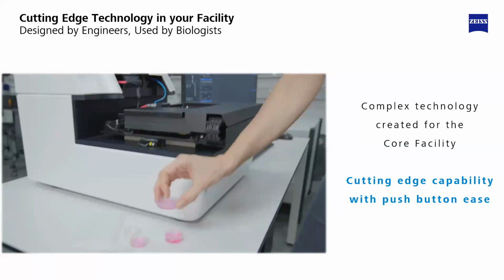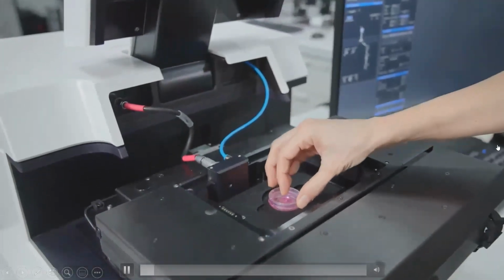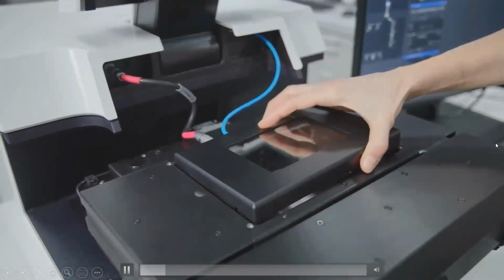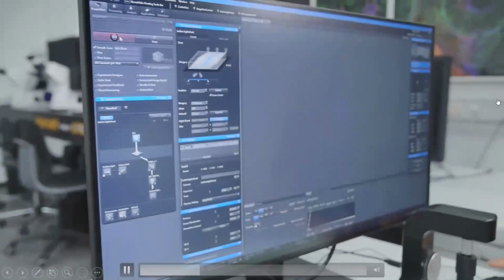Having a microscope with high technical capability, but that requires a dedicated technician to run it, does work well for some users, but often it's not the best. It's really not the best solution for having a wide user base and achieving the throughput of experiments that are expected from a central piece of equipment in a core imaging facility.